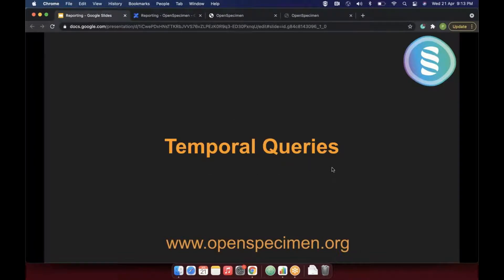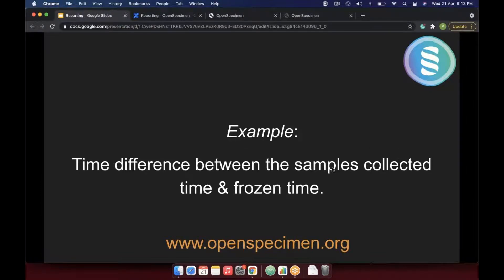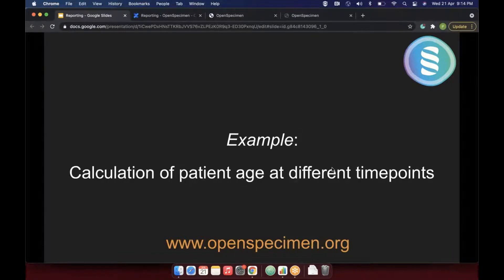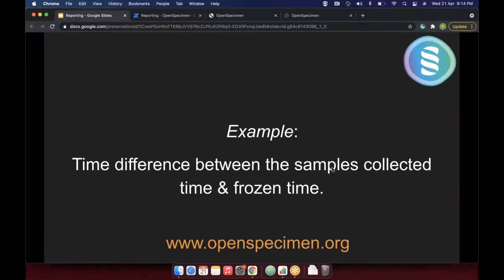The next topic is temporal queries, which allow calculations between two dates or numeric fields. A typical use case is finding the time difference between two date fields — for example, between collection time and frozen time, to see how long a specimen was kept out of the freezer. Another use case is calculating patient age at different time points when you know the birth date but didn't enter age separately. You can also calculate percentages between two numeric fields.